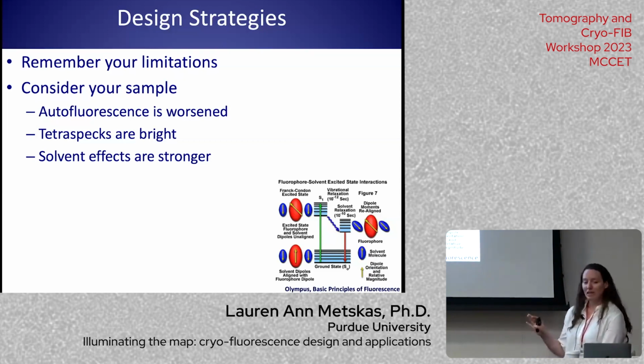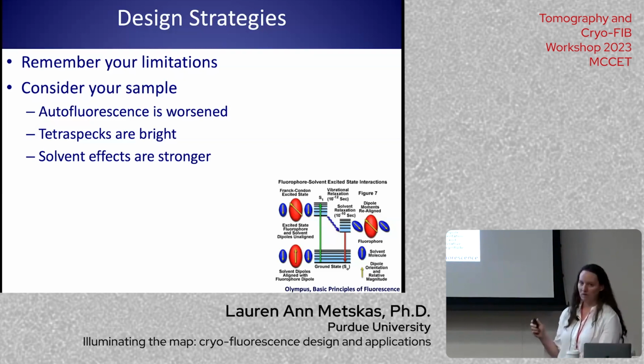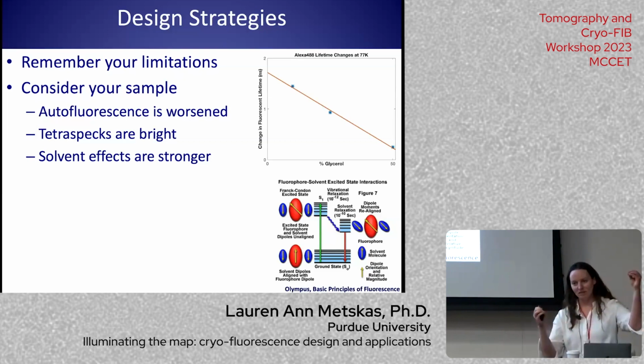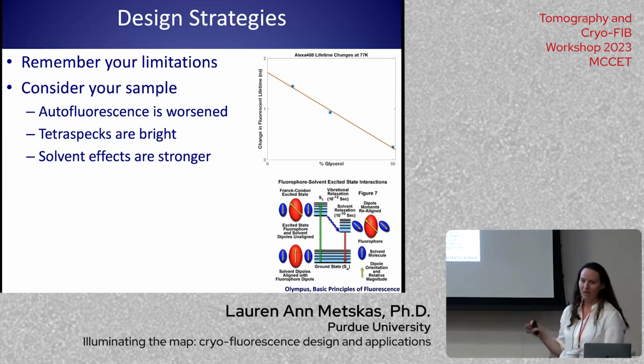But the other thing that can happen is, depending on your different compartments, they have different chemical conditions, and so you're interacting a lot more with the solvent. This is looking just at ice. I was basically making the ice more and more crystalline, and I could see that it was having a huge effect on the lifetime of the fluorophore. What this means is that if you're in the thin edges of your cell versus the nucleus, where maybe your freezing was a little bit slower, that's actually going to affect how bright your fluorophore is.